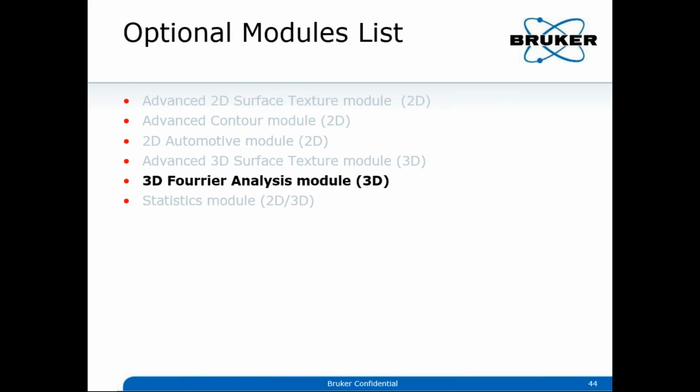So it comes with the module as well. There is also a module called the 3D Fourier Analysis module.